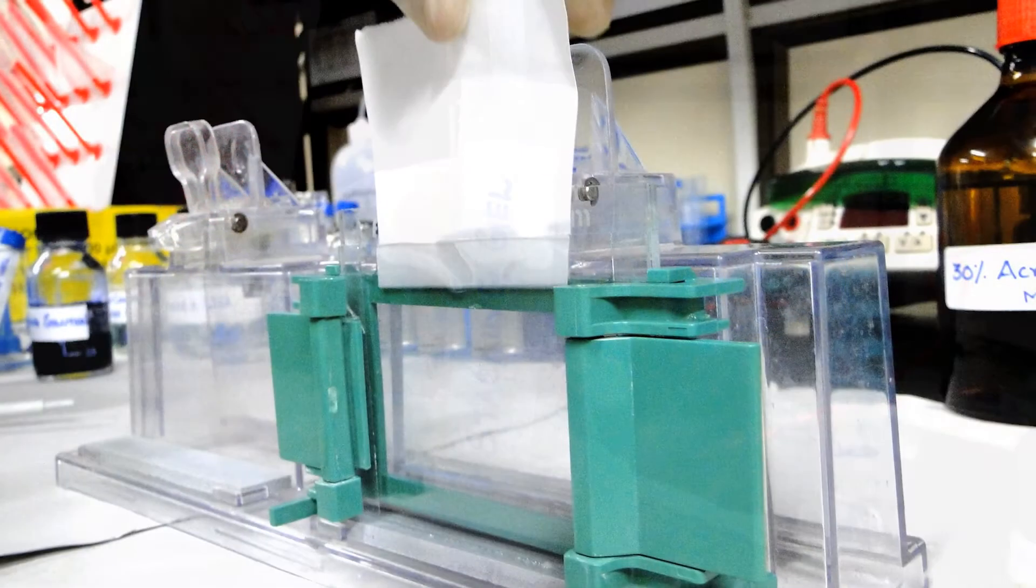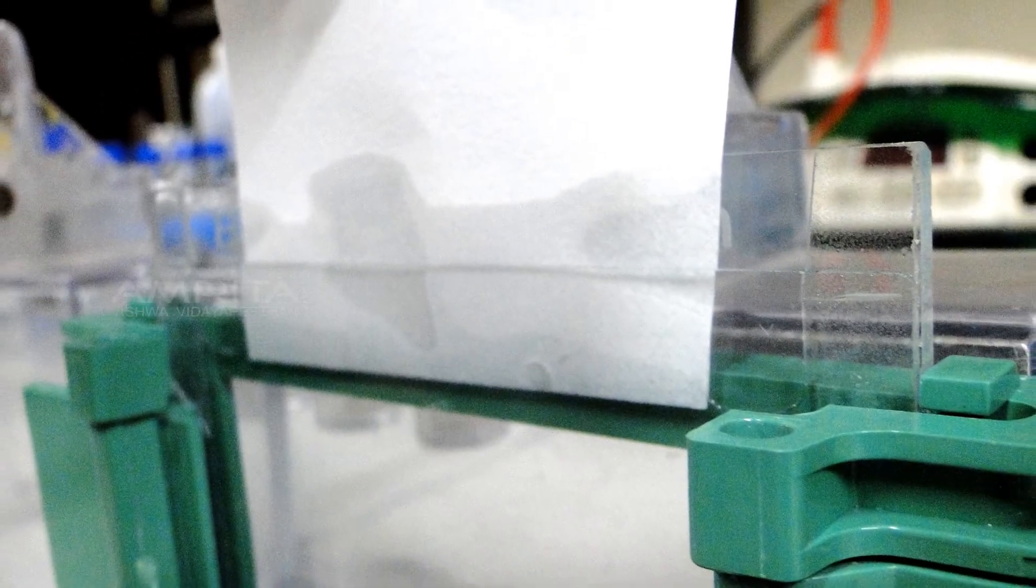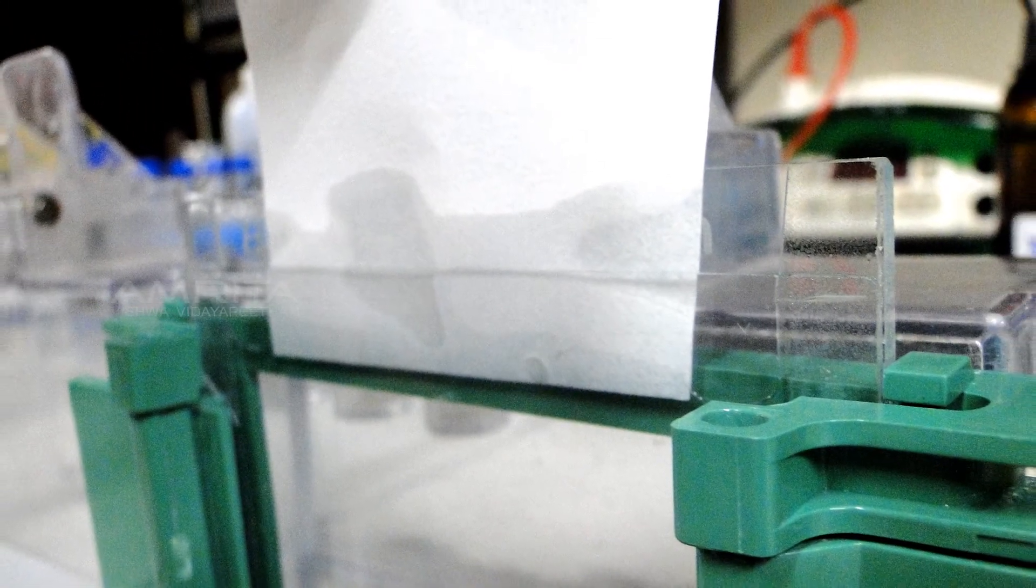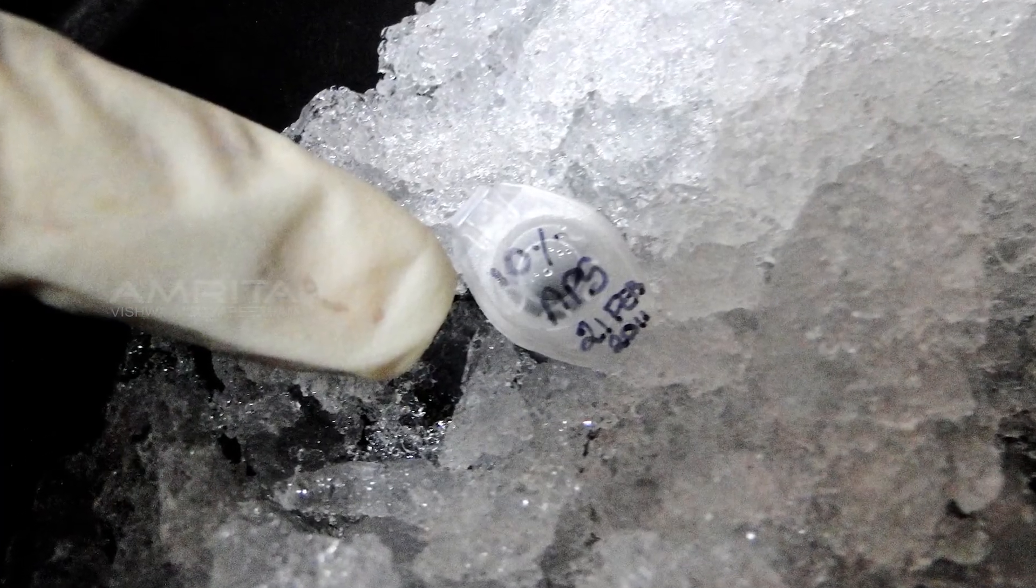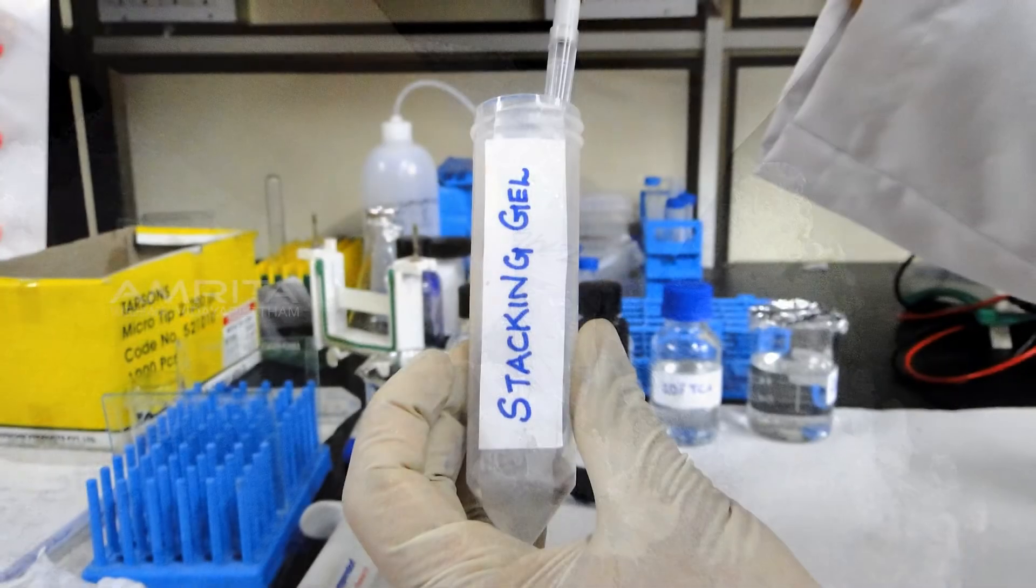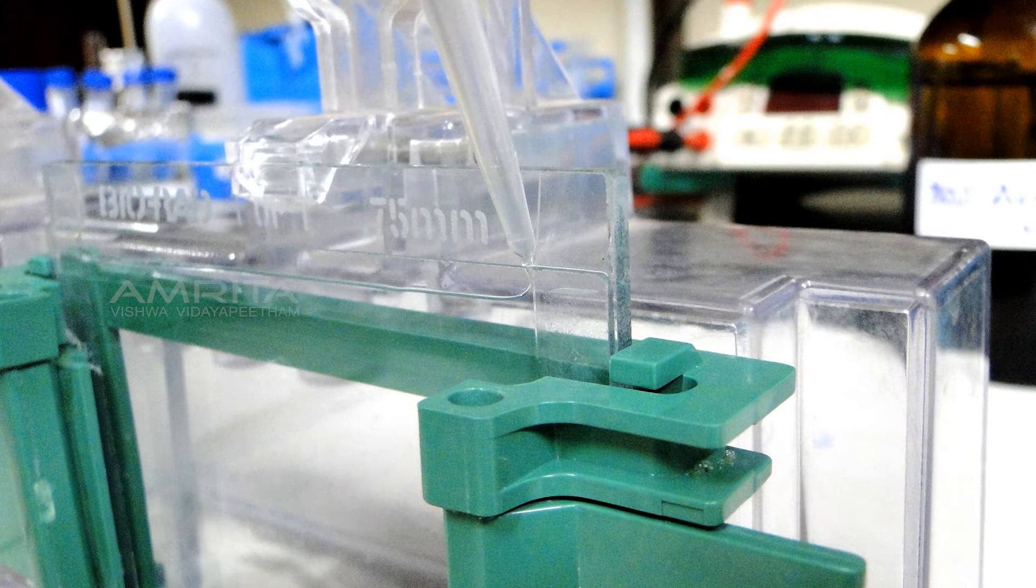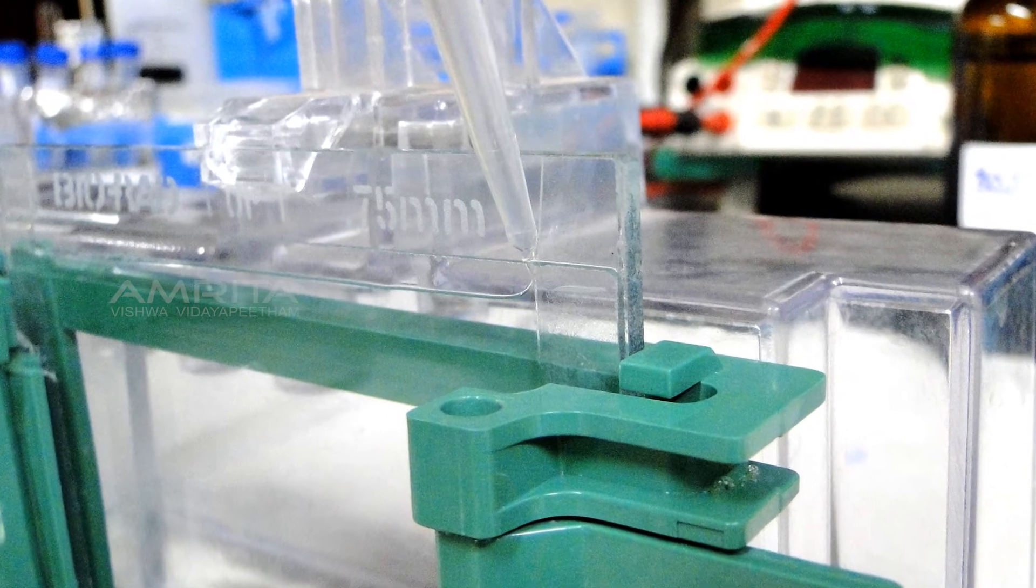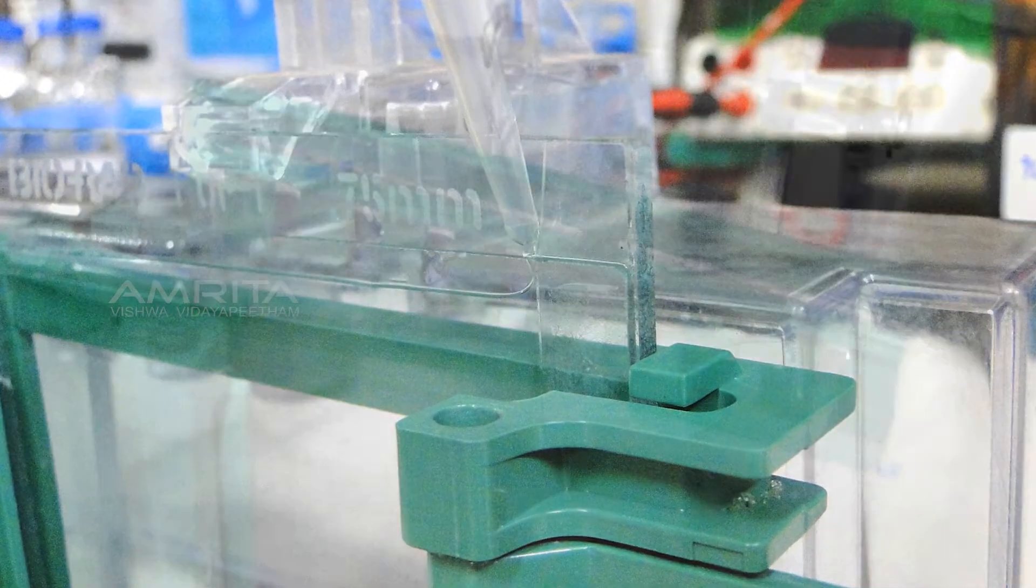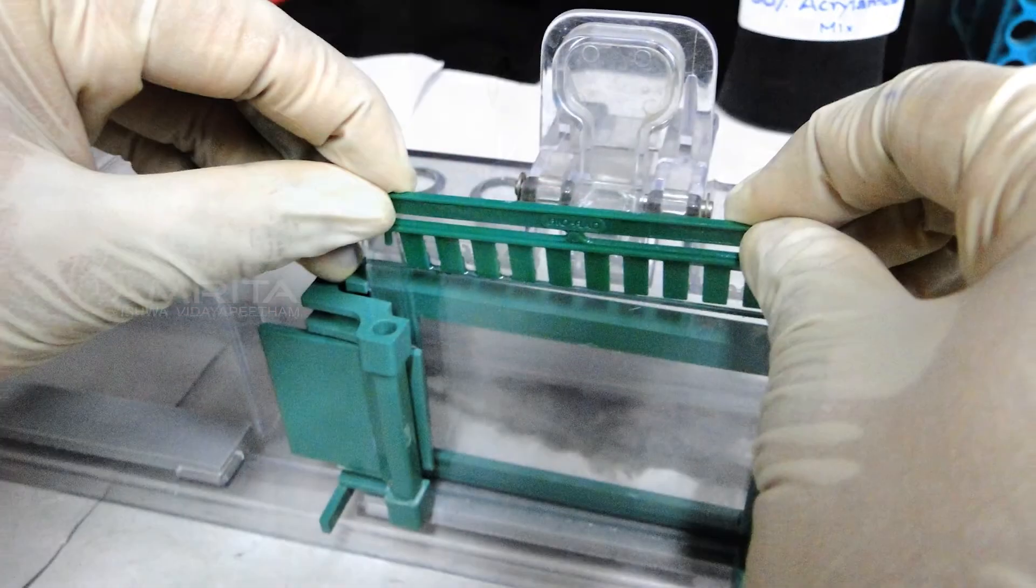After the gel has polymerized, the water-saturated n-butanol layer is absorbed by placing a blotting paper in between the glass plates. Now add 0.05 ml of APS and 0.005 ml of TEMED from the icebox to the blue capped tube. Immediately pour the stacking gel in between the glass plates till it overflows. Now place a comb in the stacking gel and allow the gel to polymerize for 10 minutes.